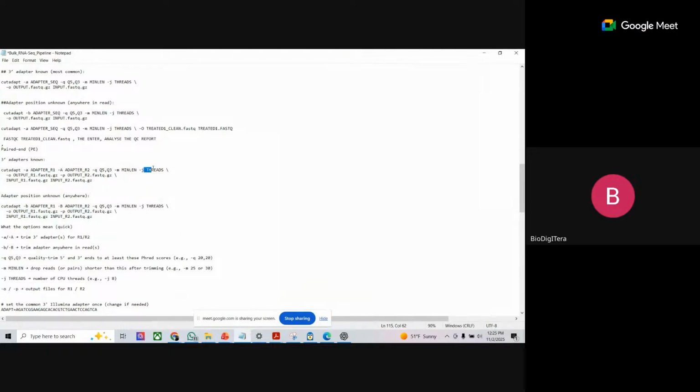This that we call the thread. The thread here is about your CPU. It is something that deals with your computer, because you choose how many threads you want to use. If you type thread, you will see that it's related to the performance of your computer. This M, I have to read it.